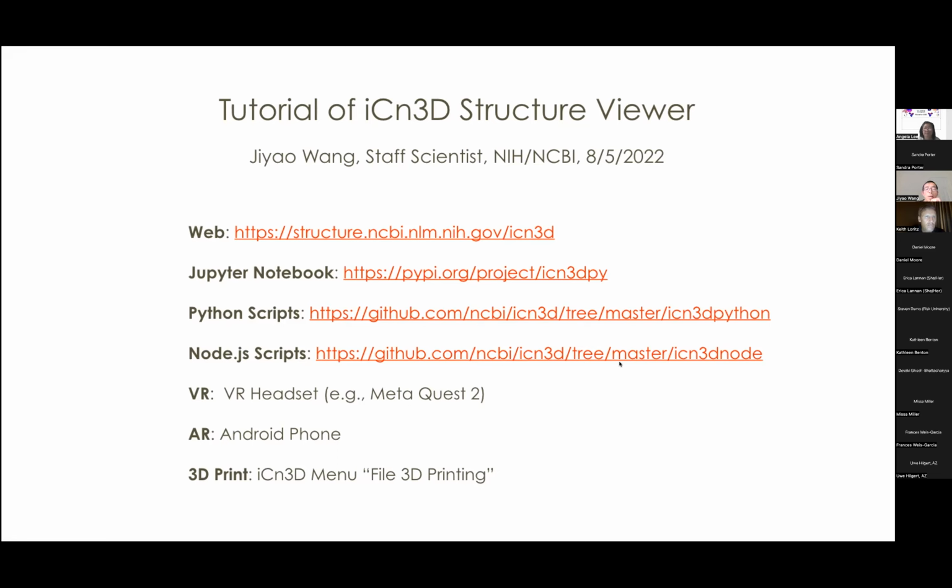So the first part is going to be very basic stuff, and we'll go through it step by step. The second part will be more advanced features. You can just listen, but you have all the links. If you click the links, you will see exactly what you saw in the slide, so you can come back and do it later.